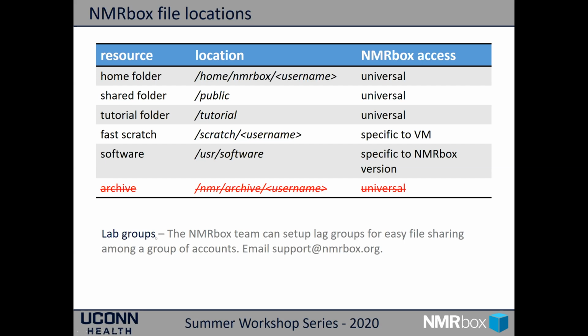And lab groups. A lot of times when people sign up for an NMRbox account, you're going to get a home folder, and whoever the username is will be the owner of those files, and the group owner of those files is also going to be the user.